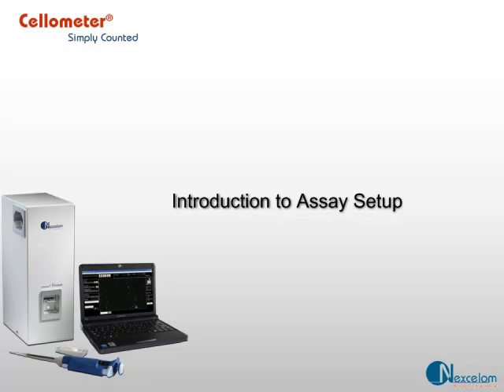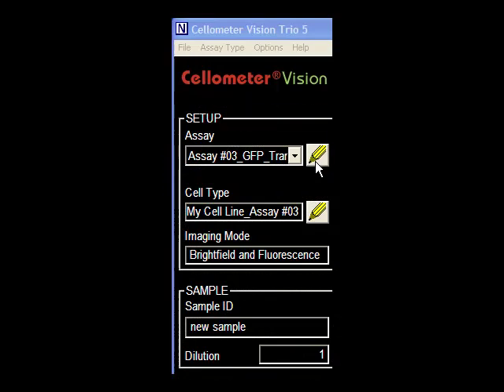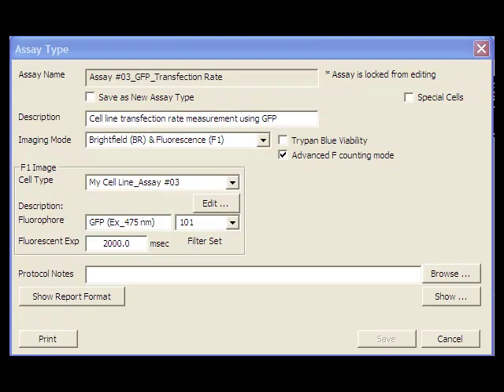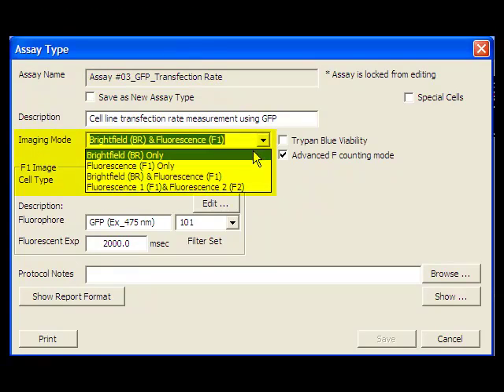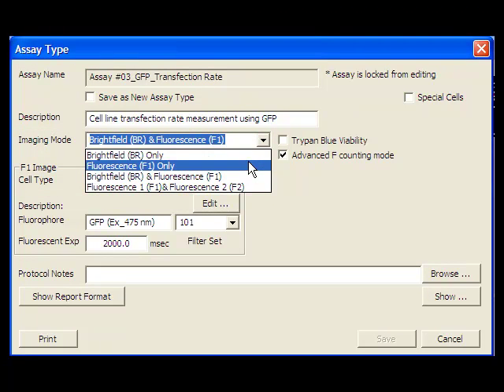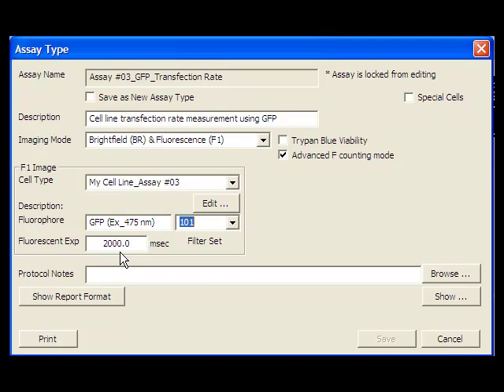Assay type controls how Cellometer Vision takes cell images. Key components in each assay type consist of assay name, image mode, fluorescent channel selection, and fluorescent exposure time.